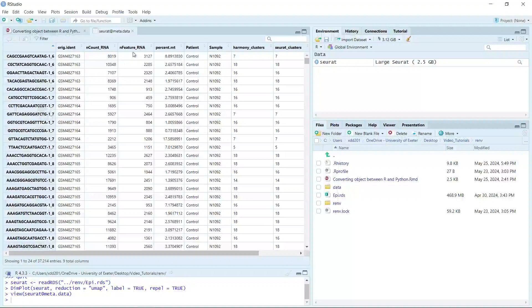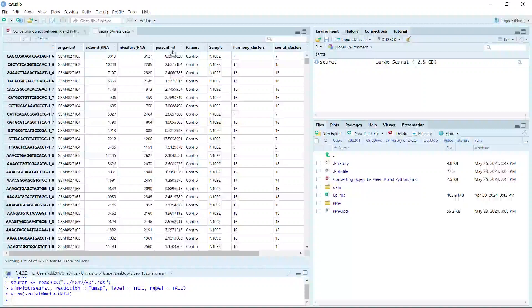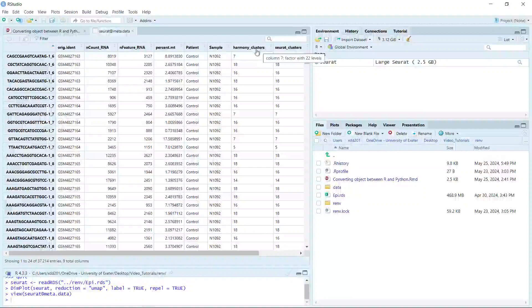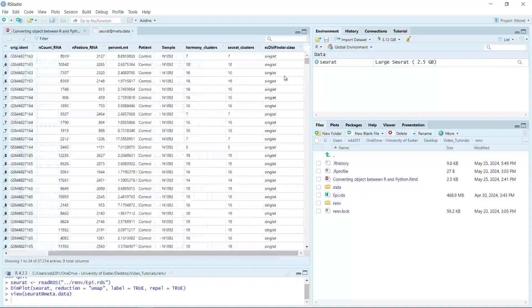We have nFeature_RNA, percentage of mitochondrial DNA, and patient and sample information. You can see I performed data integration using the Harmony method.